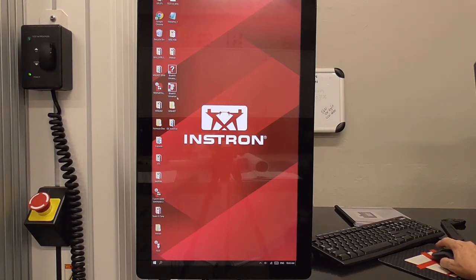Open the BlueHill Universal software here. The one with the question mark is your help page. The one with the dog bones is the software for running the mechanical tester, so we're going to open that.